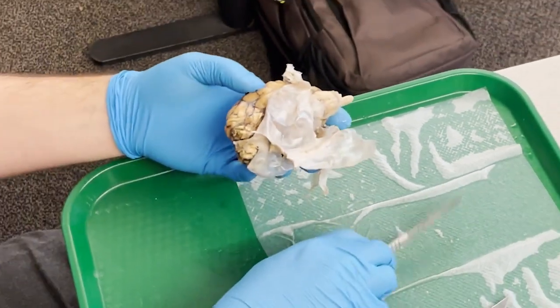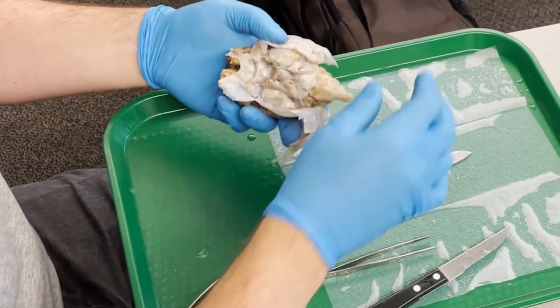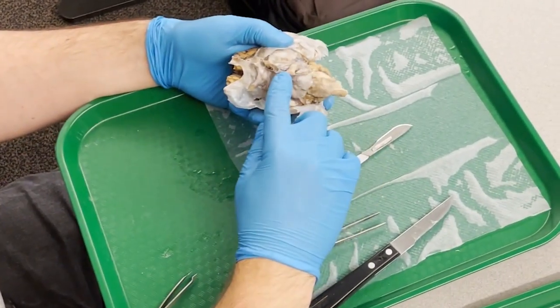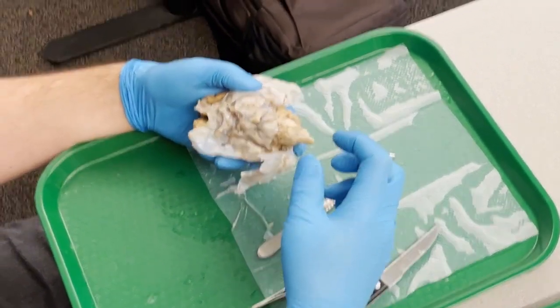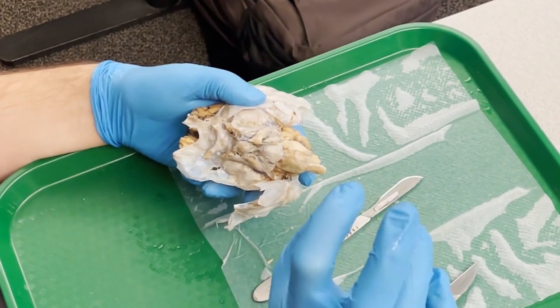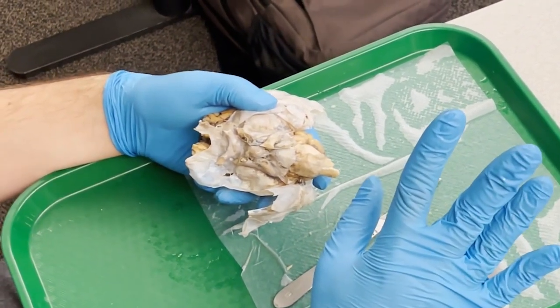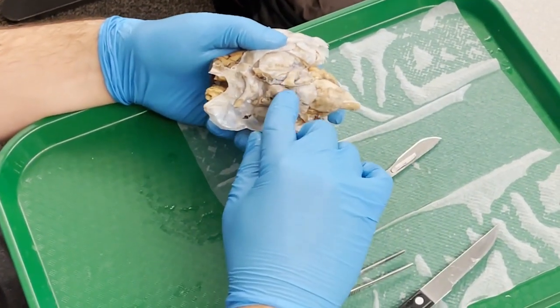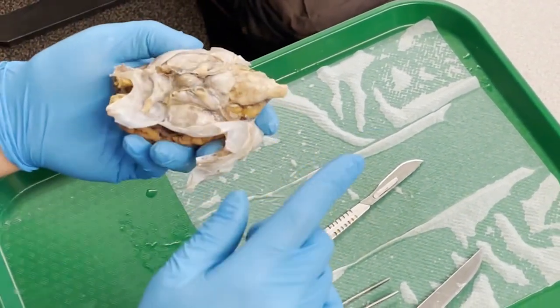There is one extra little catch. We want to be careful about the underside of the brain. Now, in the pictures, what you're going to see is that there will be some other structures that are going to come up with the dura. Certain things that might come off include the optic nerves, possibly the optic chiasm. We'll get to those distinctions of which one's which. The pituitary is definitely going to come off. That's the bulge that's at the lowest part of the brain shown here.